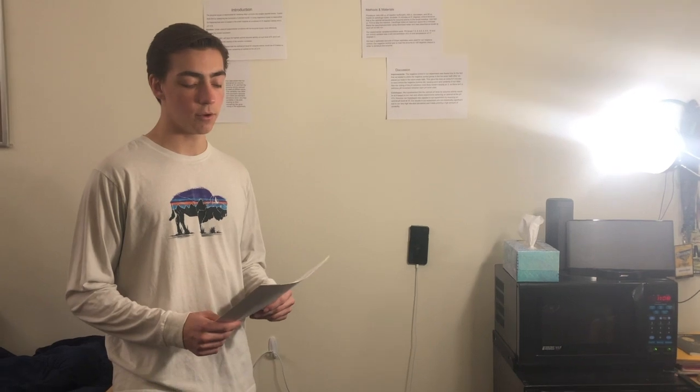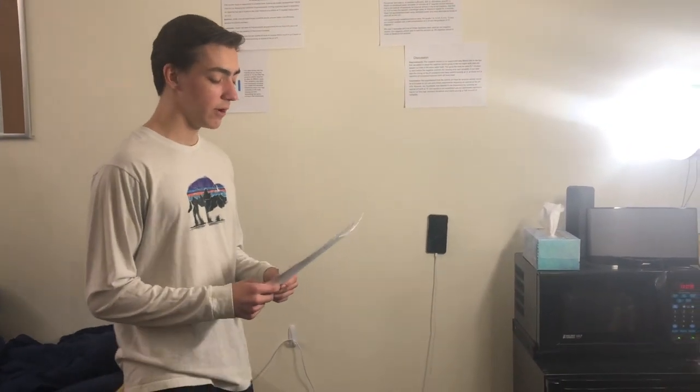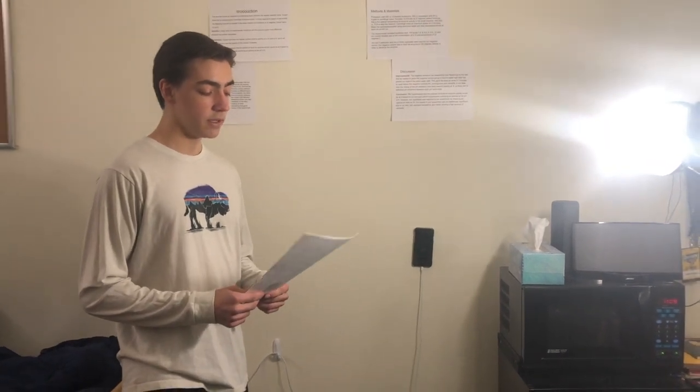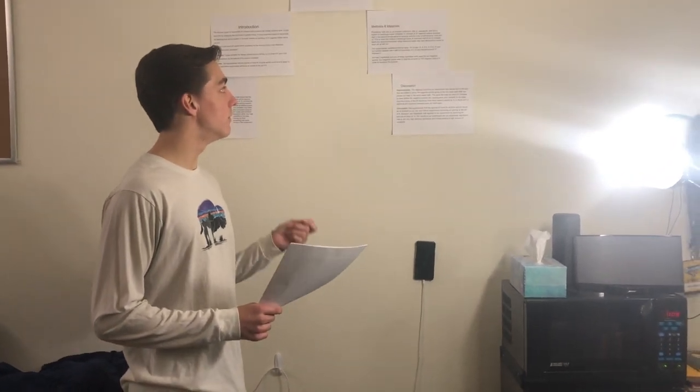So our methods and materials for this lab: our substrate used was azocasein, which is prepared chemically by adding sulfanilamide groups to the milk protein casein. Our experimental variable conditions during the experiment were the pH levels of 7.5, 8, 8.5, 9, 9.5, and 10. And the control variables in the experiment were the salt concentration of 0.15 molarity and the temperature of 37 degrees Celsius.